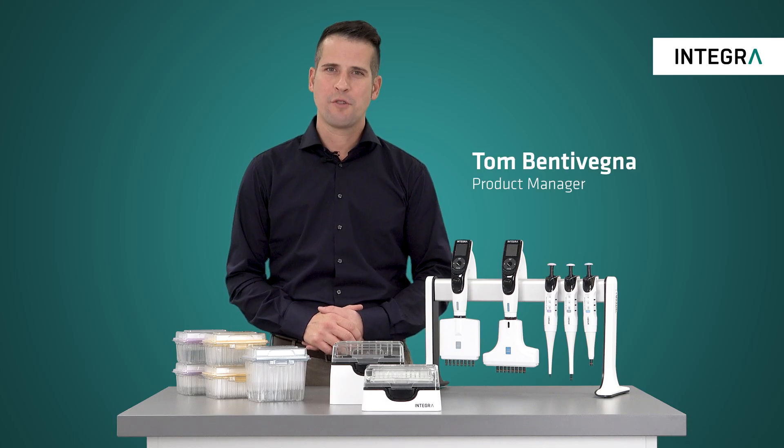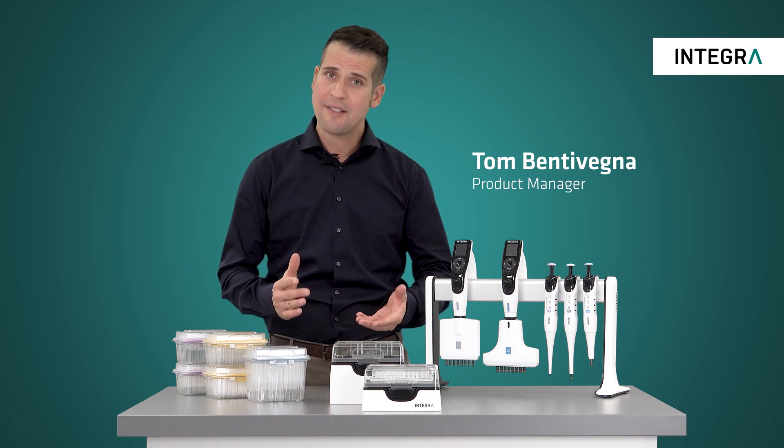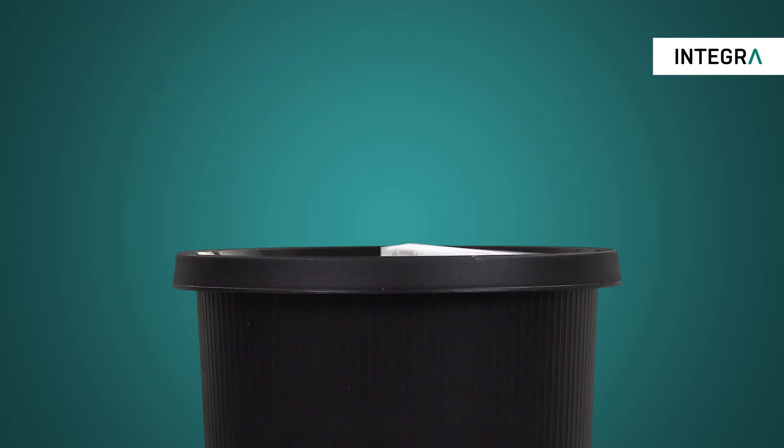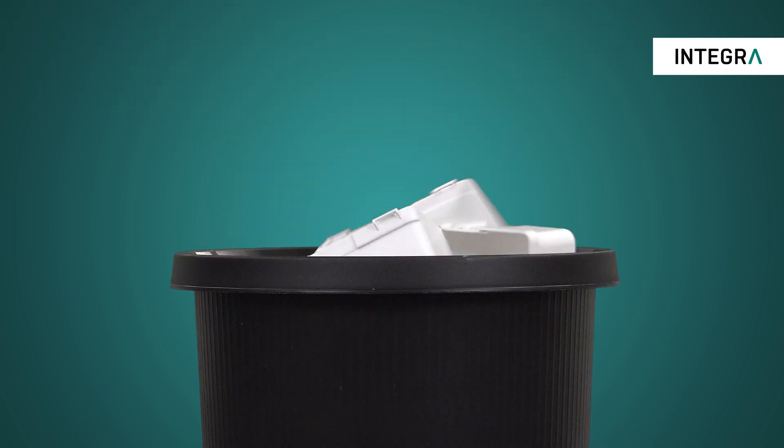Is your lab looking for ways to reduce plastic waste without compromising your research results? Are you tired of your recycling bins overflowing with all of your empty tip racks?